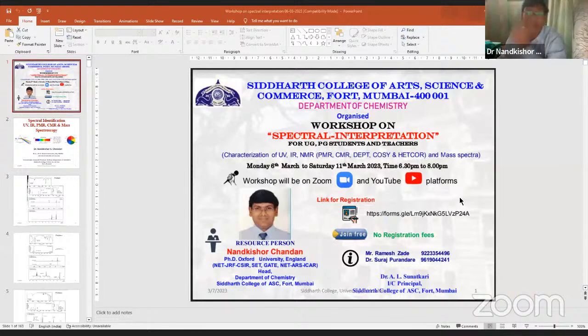UV spectroscopy deals with the chromophore and auxochrome present in the molecules, or whether there is any conjugation with the chromophore. That information is not sufficient, so we go for IR, which deals directly with the functional groups.